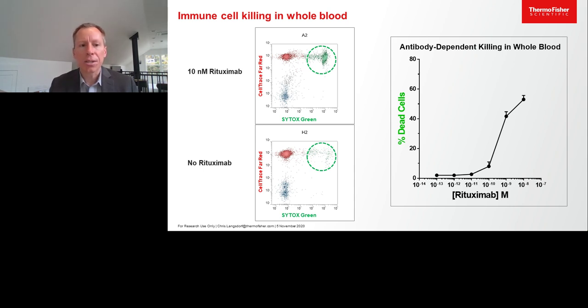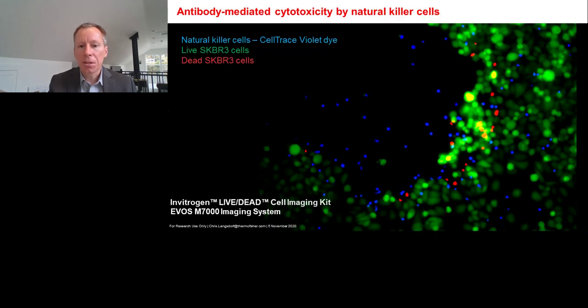But we also realize that approximately 10% of all cancers are blood cancers, or liquid tumors, you could call them. The rest are solid cancers, solid tumors. And so for this type of model, we need a different model system. And often fluorescence microscopy is used for that.